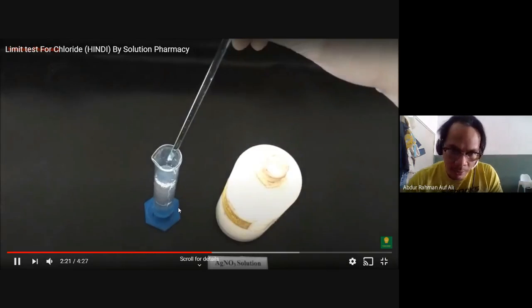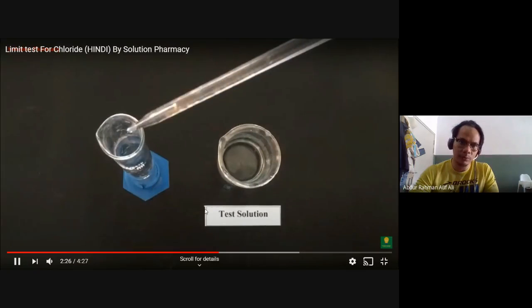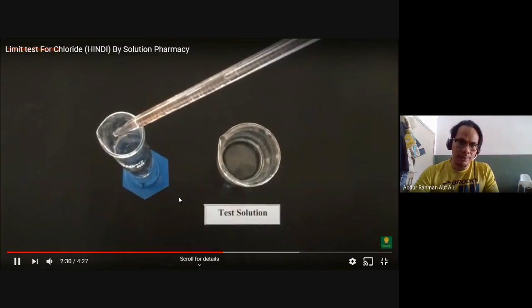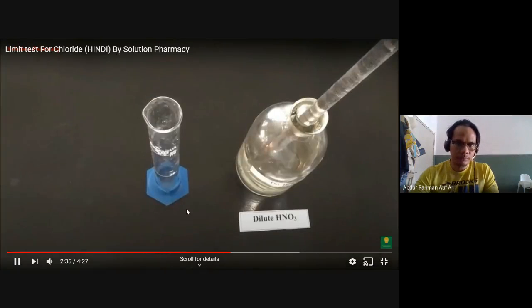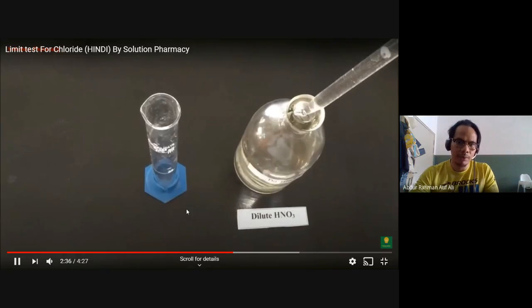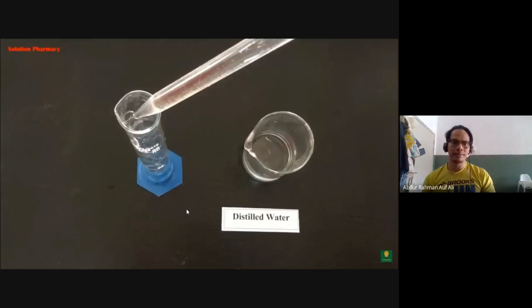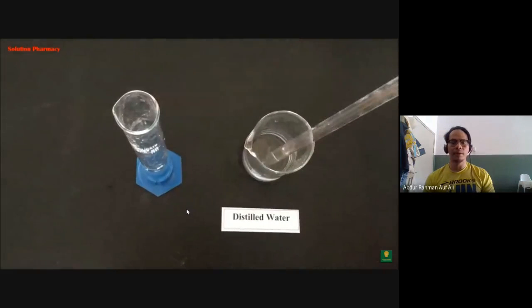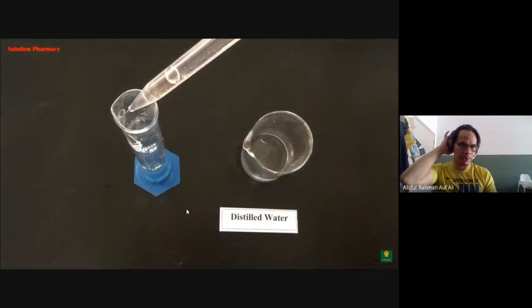So you stir until all the reaction is complete. Tengoklah, dia tengok banyak mana ada chloride dalam tu. So this is our test solution. Take 1 ml juga, and then dilute the same amount of, and then so as you can see, they guna everything, they measure everything guna pipette. 1 ml ke 10 ml ke, nak top up sampai 50 ml pun dia guna pipette proper.